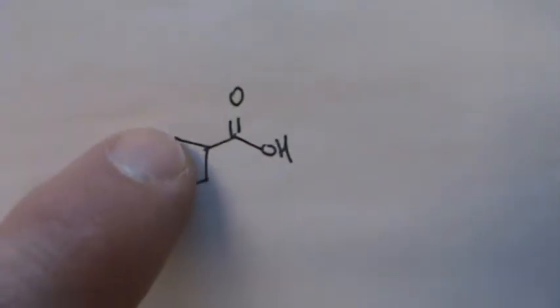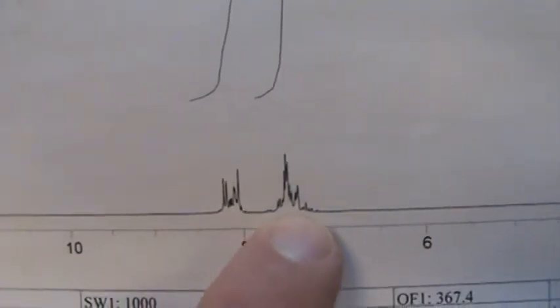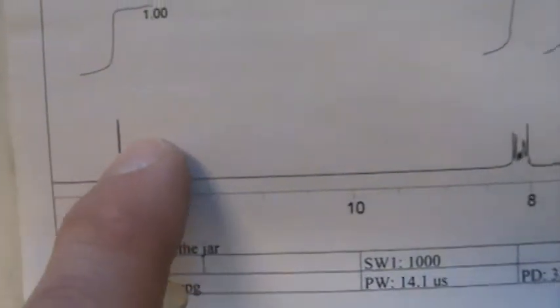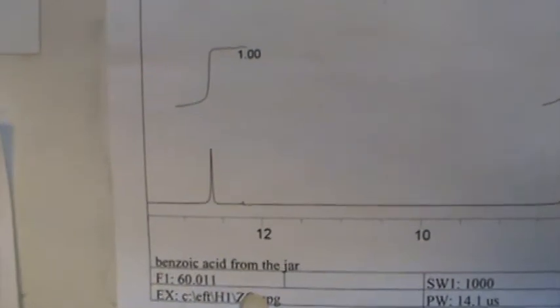It turns out that normally what we say is the ortho positions, those 2 ortho hydrogens on the ring. When they're next to a carbonyl like this off the ring, those are the ones that get shifted further to the left. So that's what those 2 should be, the remaining 3 are those. And of course, the day I ran it, instead of getting a very broad, flat OH hydrogen signal, this one came out sharp and even integrated to 1 past 12. If somebody else runs it or other ones you get off the internet, it might be a broad peak. They're variable as always. This is a solid, so it had to be dissolved in some kind of solvent. So depending on the concentration, you're going to get various looking OH type hydrogens.